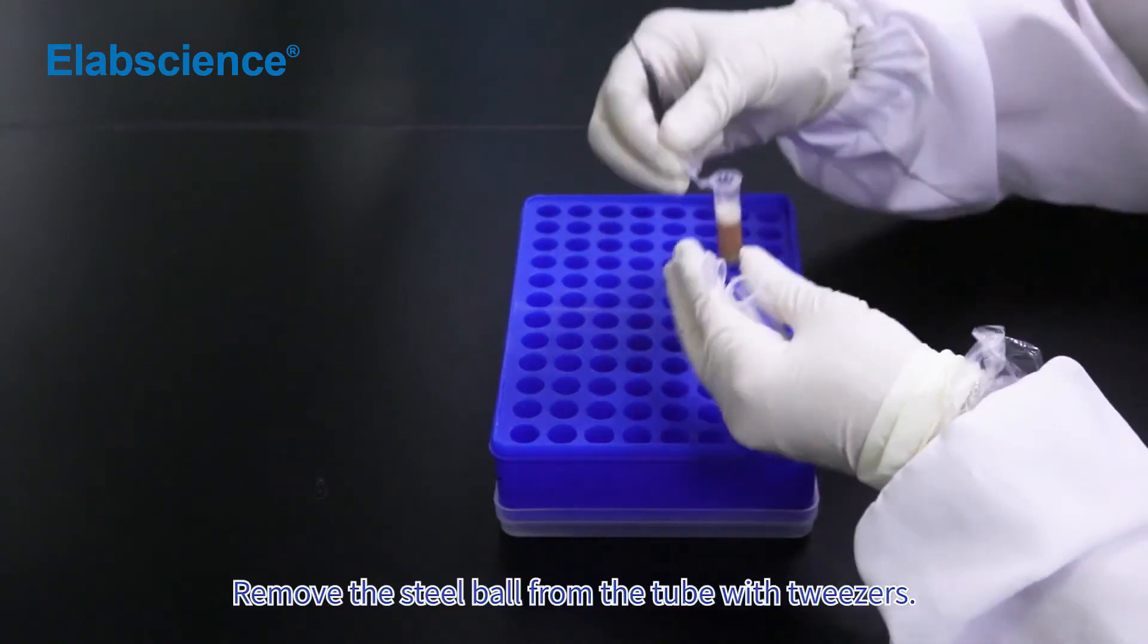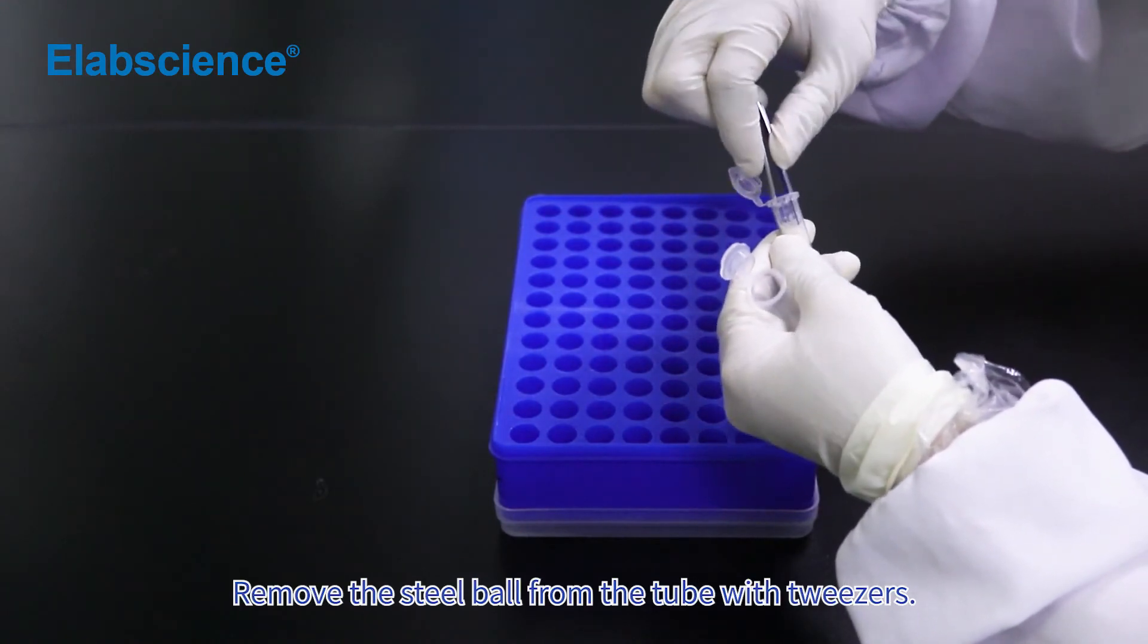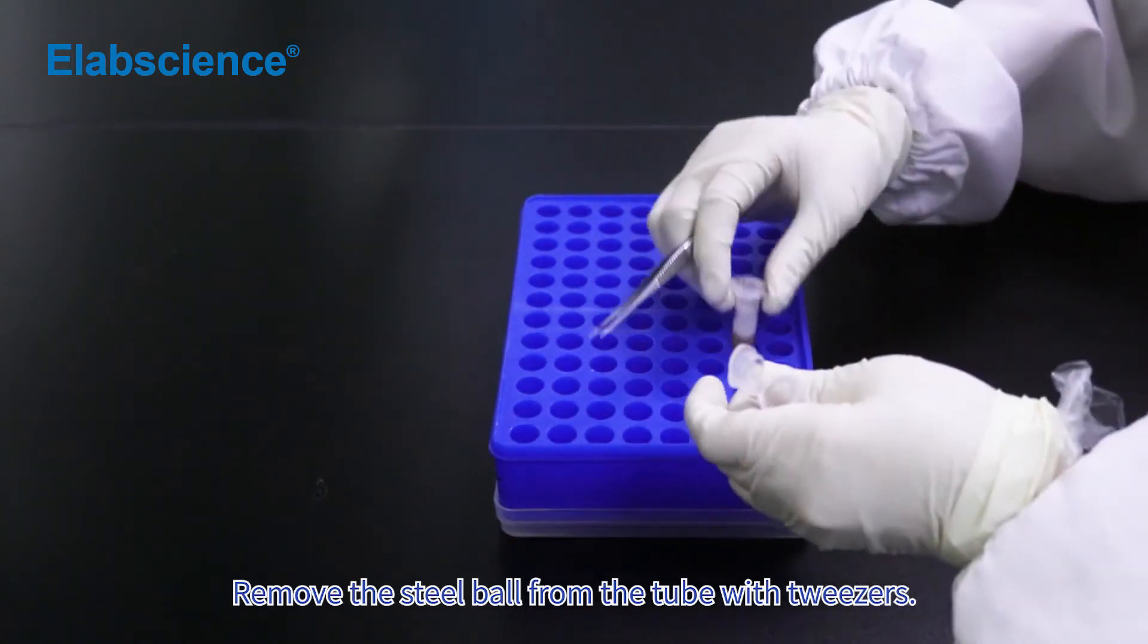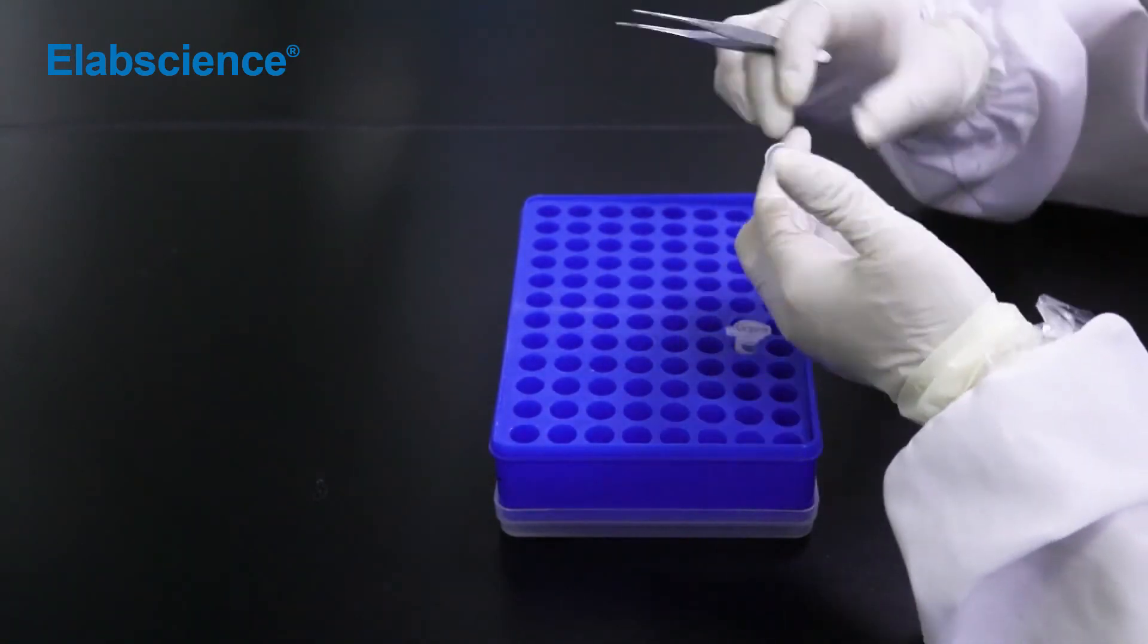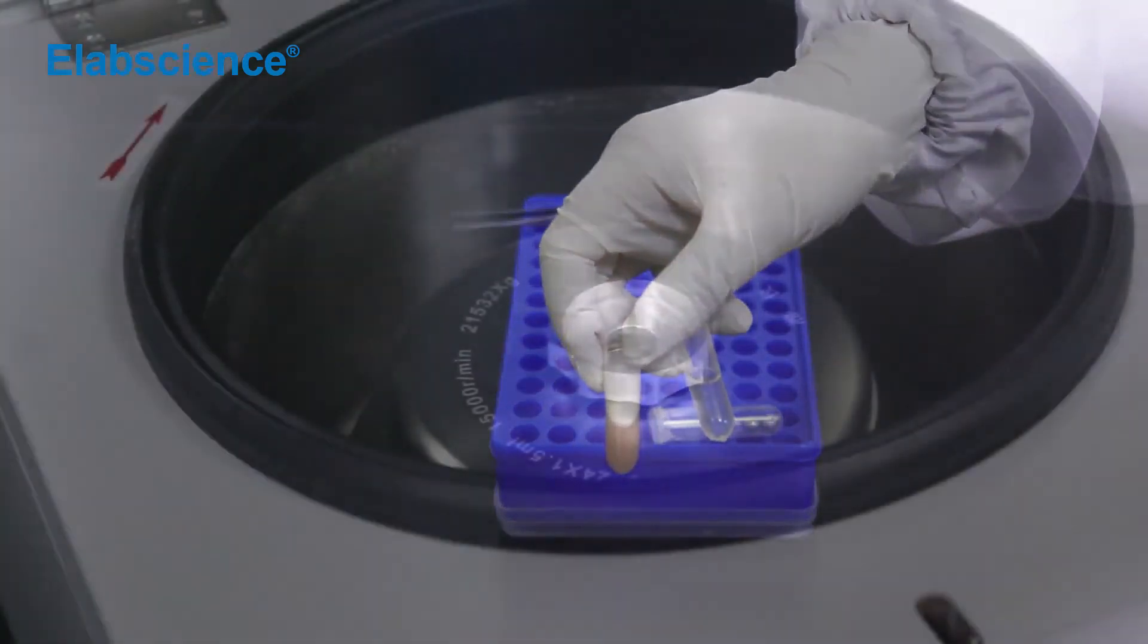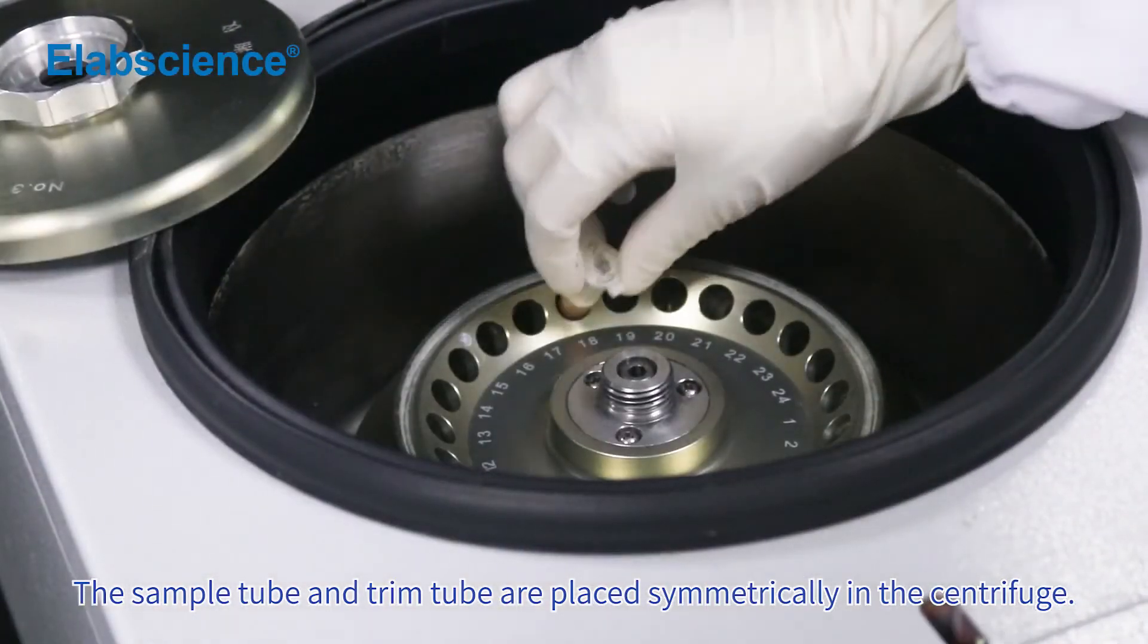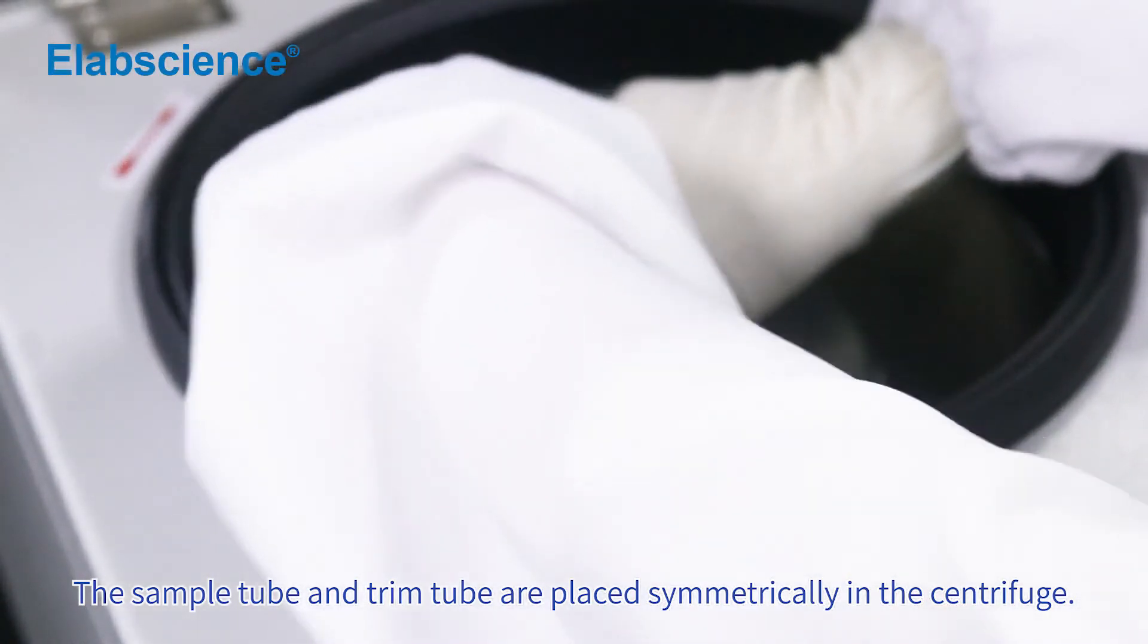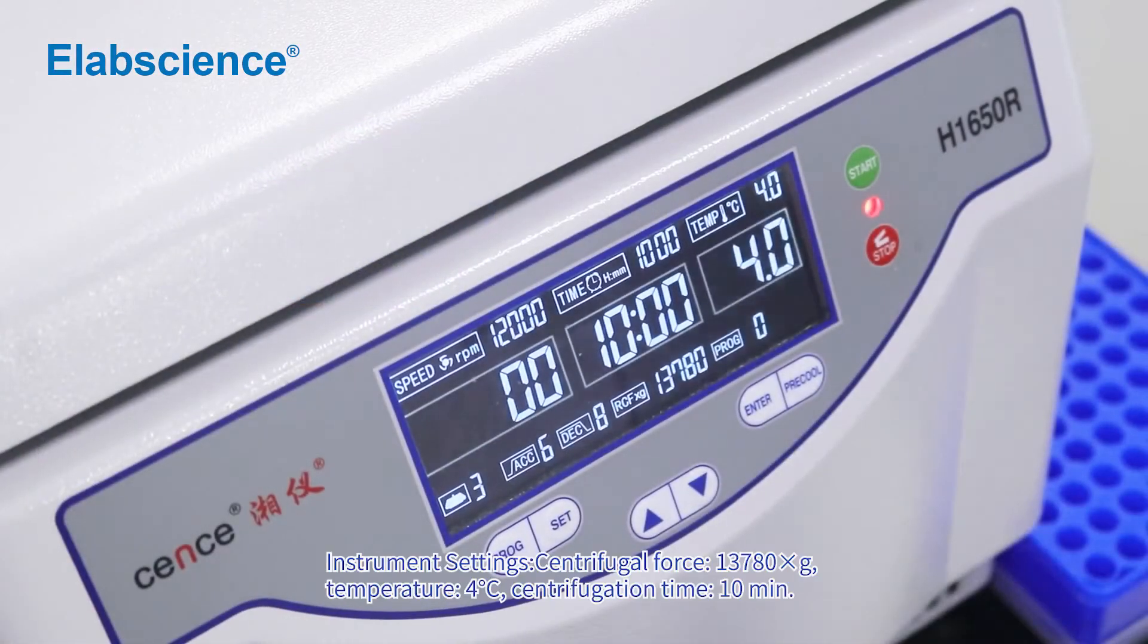Remove the steel ball from the tube with tweezers. The sample tube and trim tube are placed symmetrically in the centrifuge. Instrument settings.